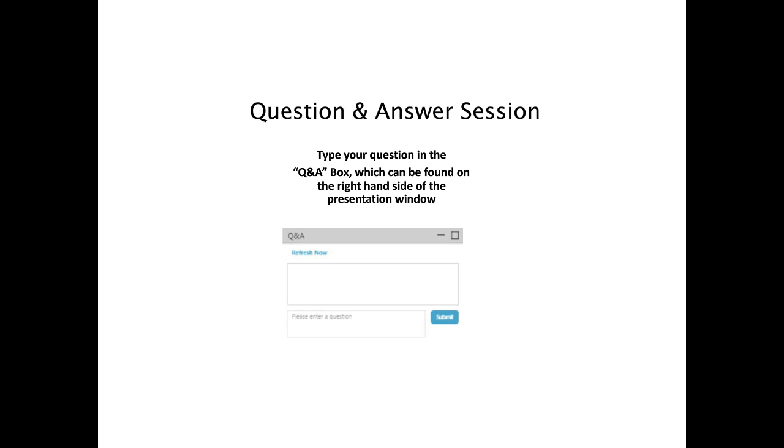Thank you. Here's another question. Is MALS preferable over LALS detectors for molar mass determination? Sure. MALS is an acronym for multi-angle light scattering, and the idea is with several detector angles, you can get the variation of the scattering as a function of angle, and that's a measure of the Rg, or the radius of gyration of the molecule.